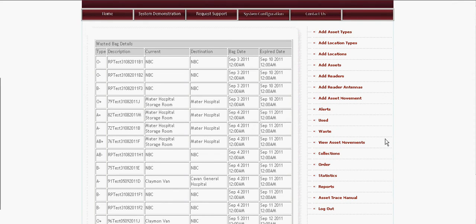So these are the operational screens, and these screens are the data collection points and the points which allow us to get a picture of what's going on. But from a management perspective, really the reporting area is where the value and the strength and the power of this starts to come to bear.